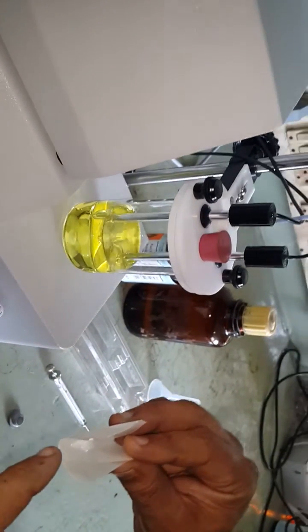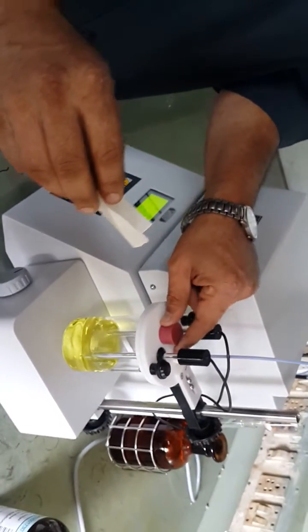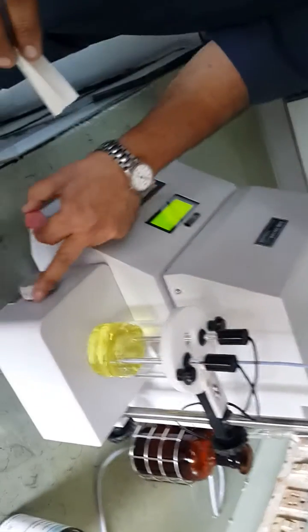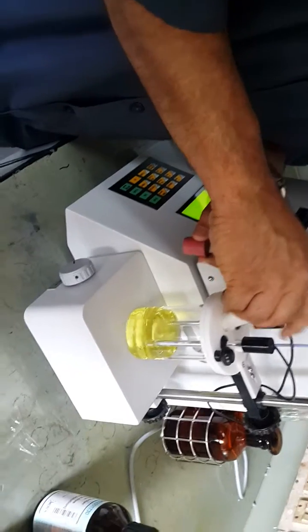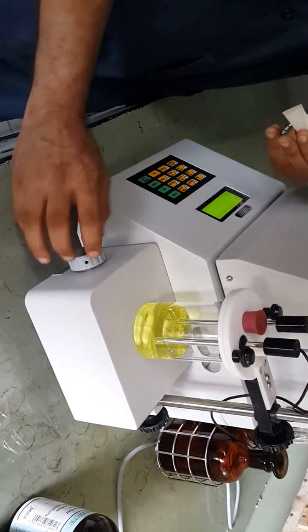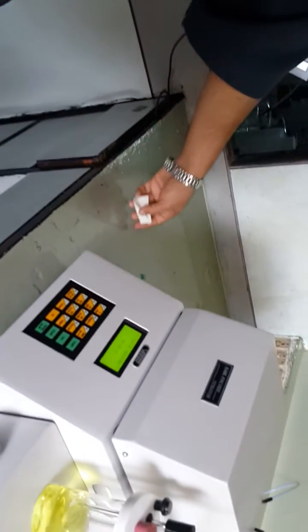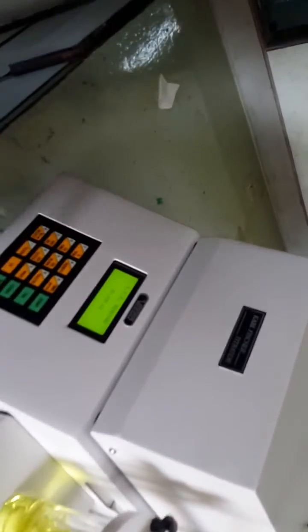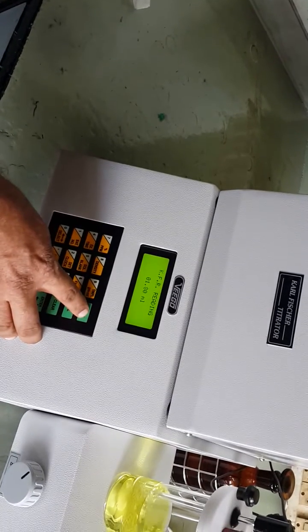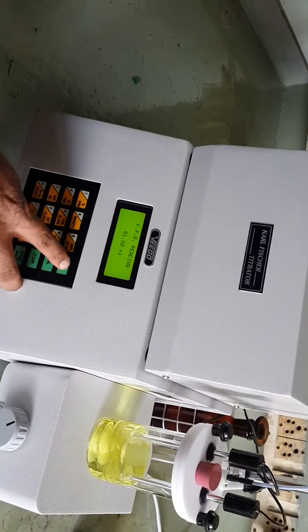The sample is a solid powder taken on a piece of butter paper. Remove the stopper, stop the stirrer, and add the sample into the vessel. Replace the stopper and ensure the sample is fully added into the beaker. Start the stirrer again. Re-weigh the paper to find the weight of sample added. After the sample is dissolved, press the start key so that the water content from the sample will be titrated.